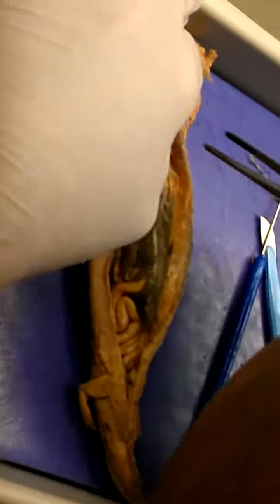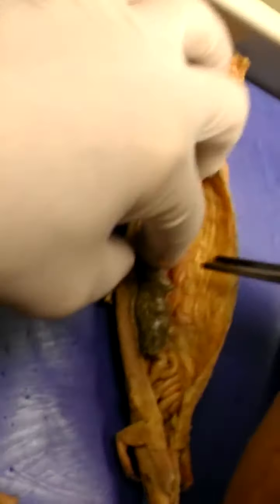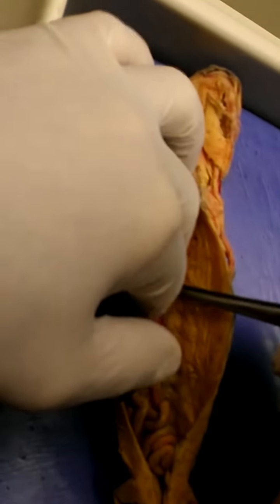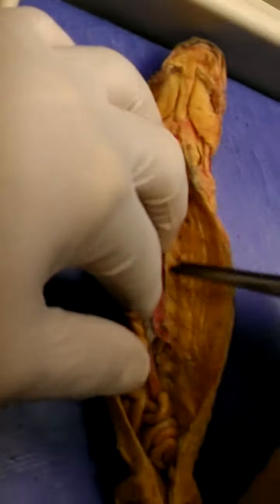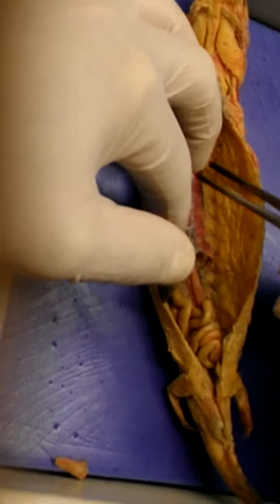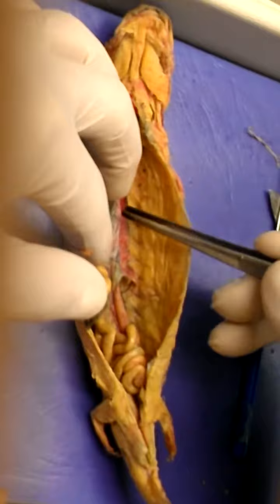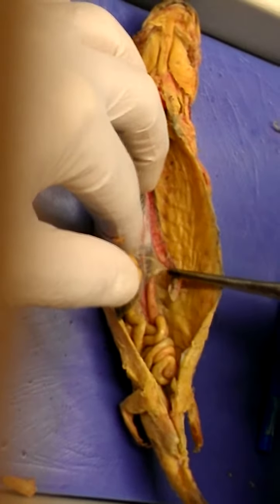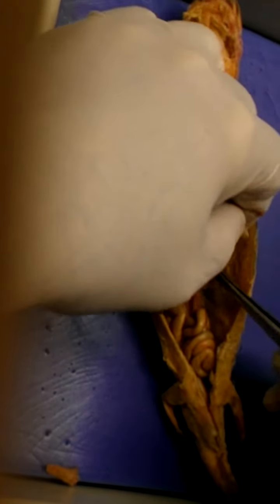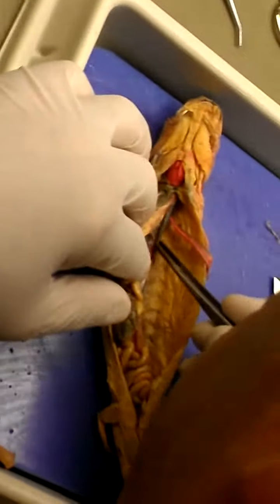Now, it should be possible to find here. Yep. A small rudimentary lung, and that's this thing that's got lots of blood. So it's got these red blood vessels around it right here. This is the lung right here. Okay. And I'm going to pull it up a little bit and take it out. So that's the lung right there.